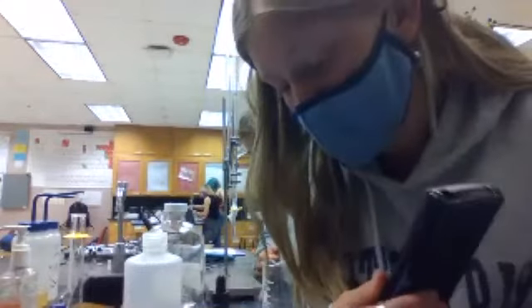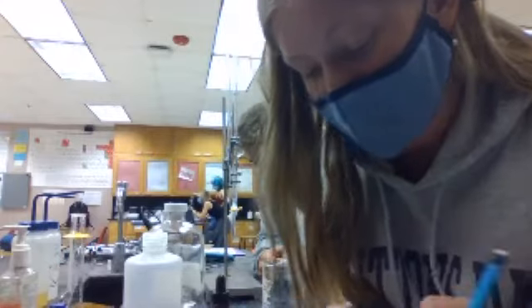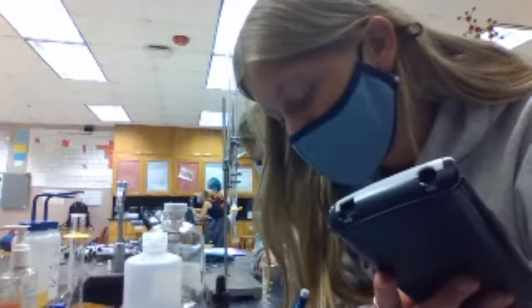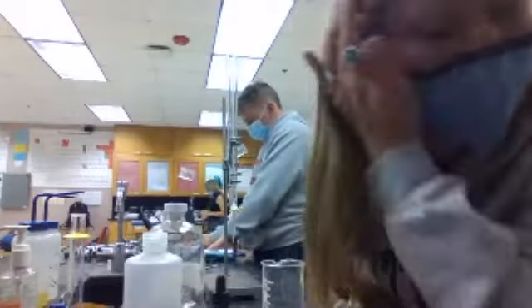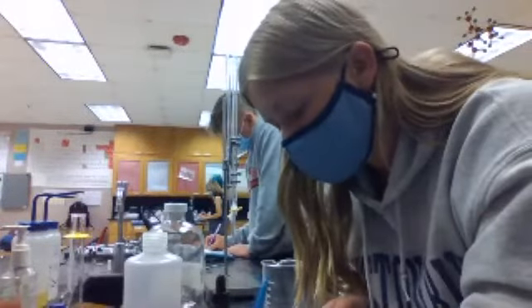Okay, so in the equation, we use the difference between the final volume and the initial volume of the acid. So 30.00 minus 19.99 is 10.01 times 0.11 divided by 0.130. I thought the molarity of the acid was 0.102. No, that's the molarity of the acid from yesterday. We're in a whole different. Oh. It is the same acid, but you go with what you get this time.